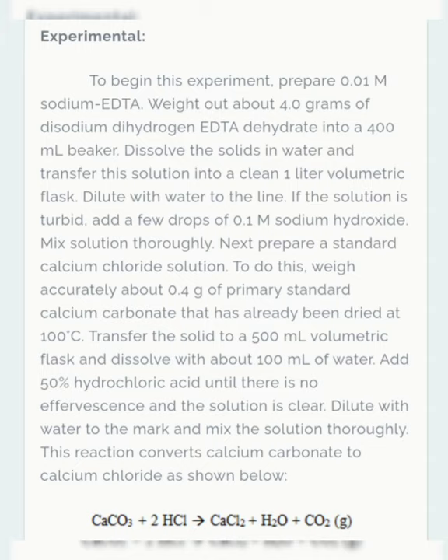To begin the experiment, prepare 0.01 molar sodium EDTA. To prepare the calcium chloride solution, you have to use calcium carbonate and hydrochloric acid.